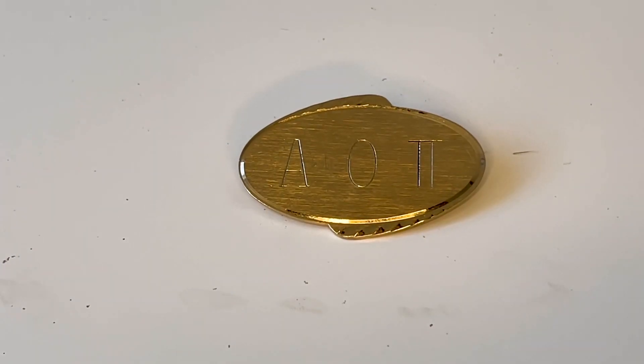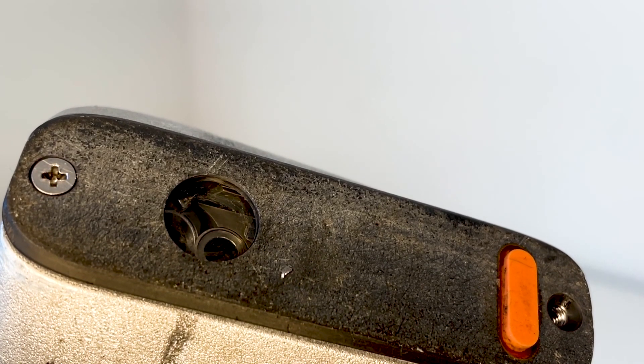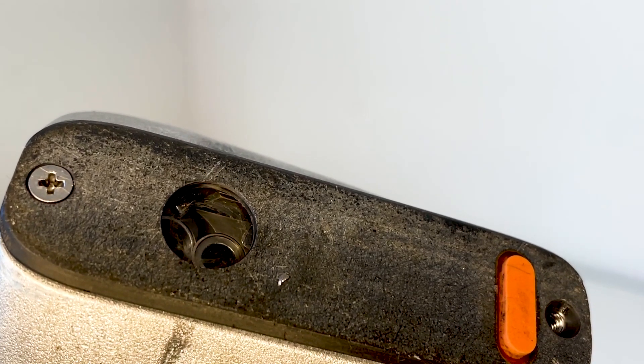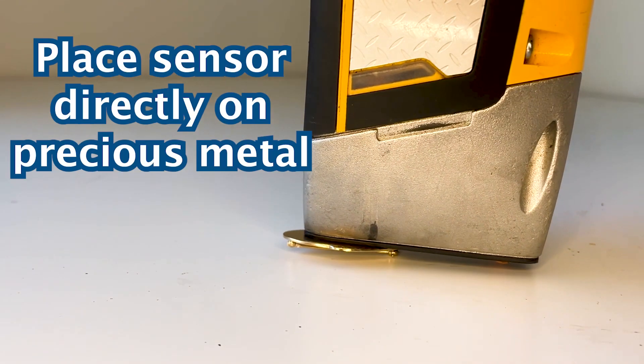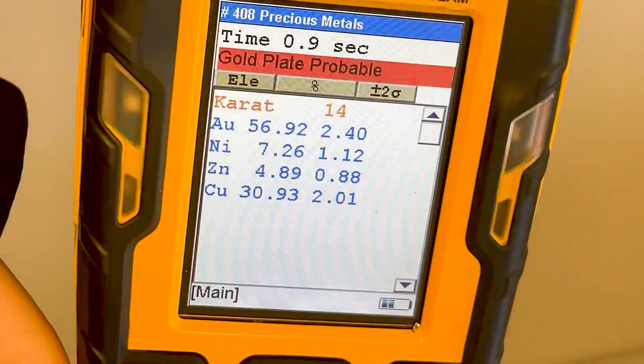For our first test, let's test this gold pin. The x-ray sensor will pick up anything within close range, so make sure your precious metal is the only thing in the sensor's range. This piece of gold covers the whole sensor, so we can test it on a flat surface. Place the sensor directly onto the precious metal, pull the trigger and hold it for 10 seconds while the results generate.